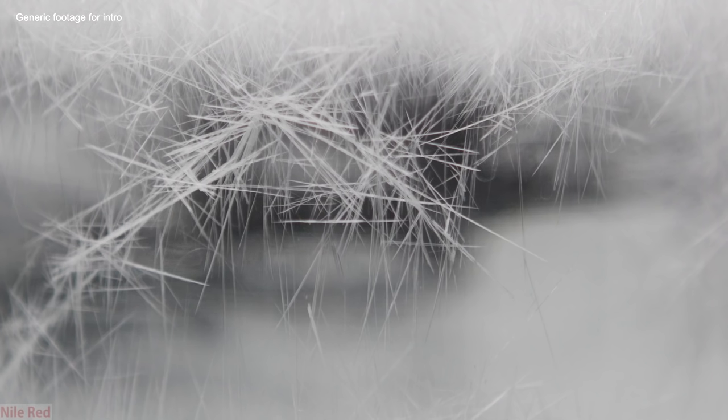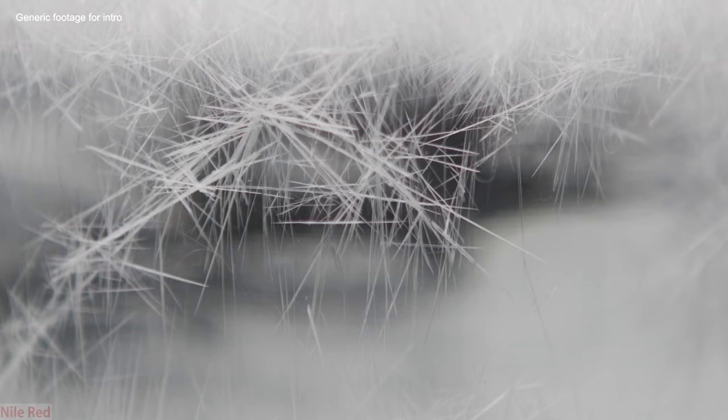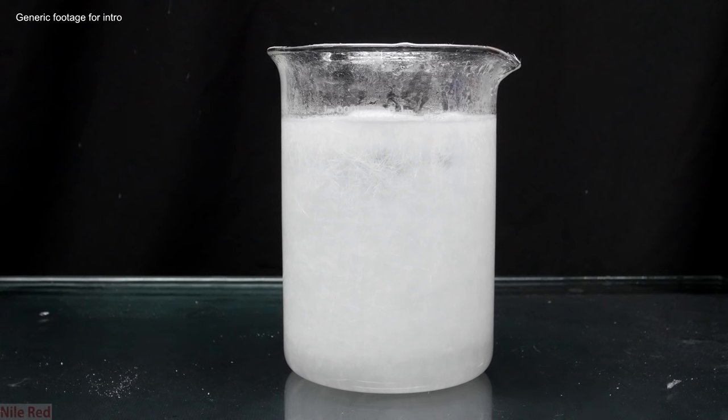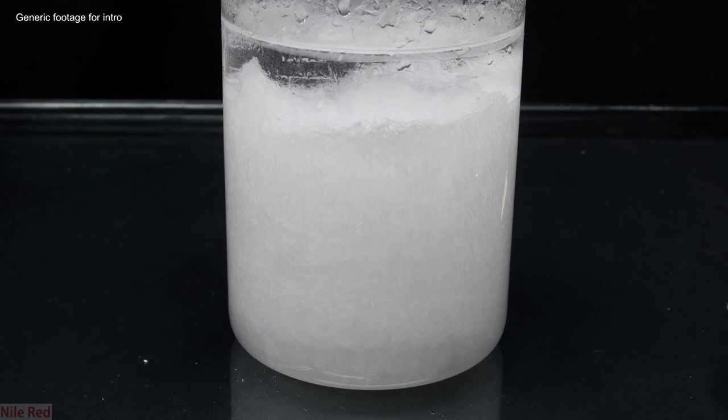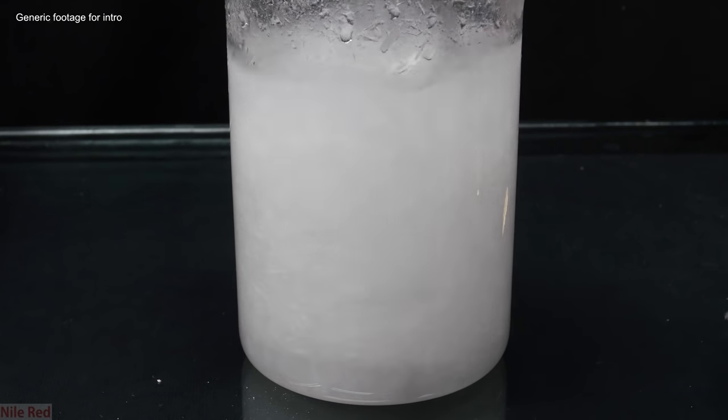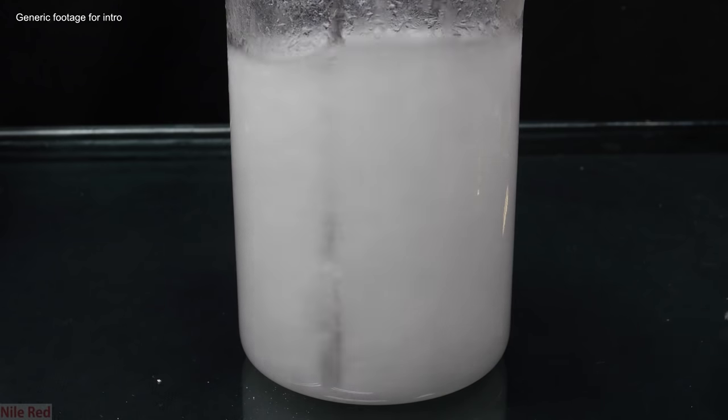Maybe you can see that this is just a recrystallization with an added step, and it's not too complicated. The common theme between these two methods of recrystallization is that they both use a single solvent, but the more complicated version is when we use a multi-solvent system. We use multi-solvent systems when we can't get a single solvent to satisfy our requirements. Our basic requirement is that our compound is very soluble in hot solvent, but not very soluble in cold solvent, but the impurity is soluble in cold and hot.